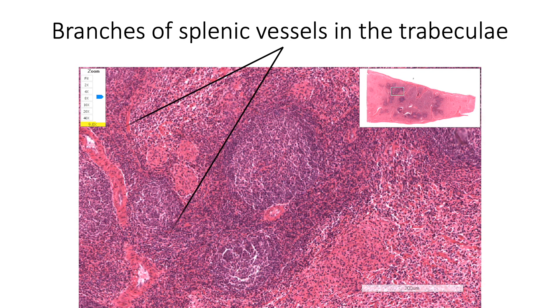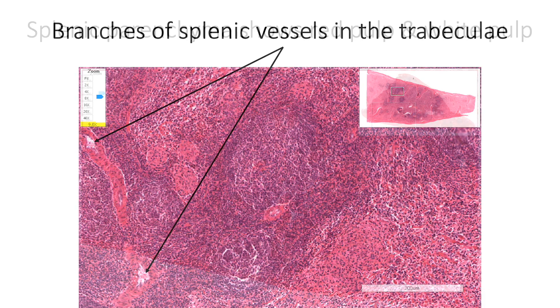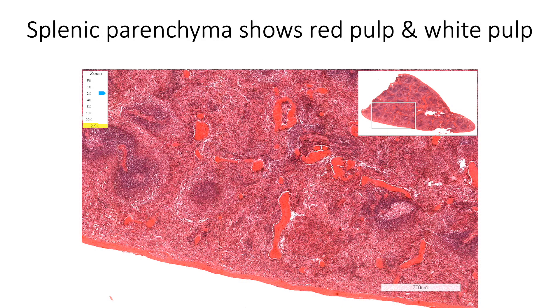Here we are seeing the branches of splenic vessels in the trabeculae. Splenic parenchyma is described to have two regions, the red pulp and the white pulp, based upon their appearance. In the freshly cut surface, white pulp appears as white opaque dots to the naked eye up to 1 mm in size, contrasting with the surrounding reddish-purple colored red pulp. In the routine H&E stained histology section, white pulp appears intensely basophilic in contrast to eosinophilic red pulp.